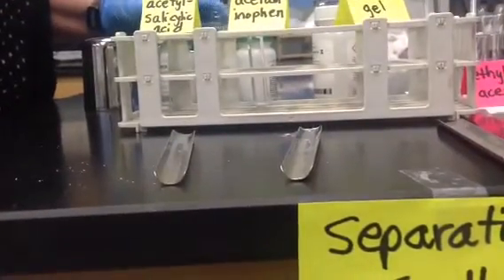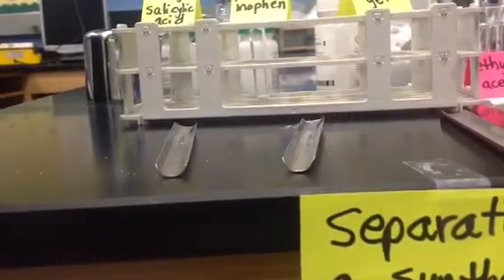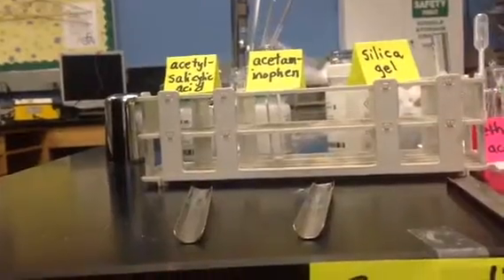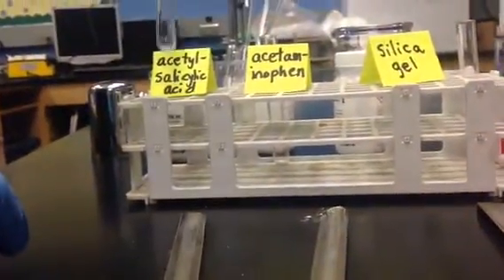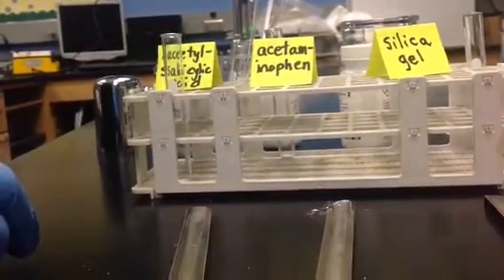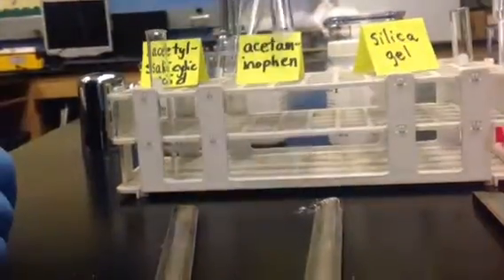And the only other part we have to look at is just the acid and the acetaminophen, and I've already got the amount in each of those test tubes. So that is my acetylsalicylic acid, and I have the small amount of the acetaminophen.